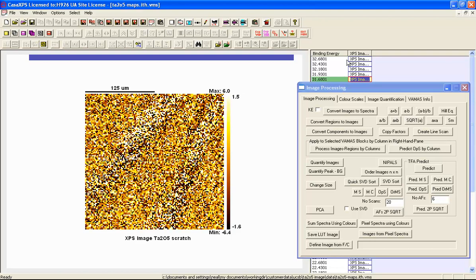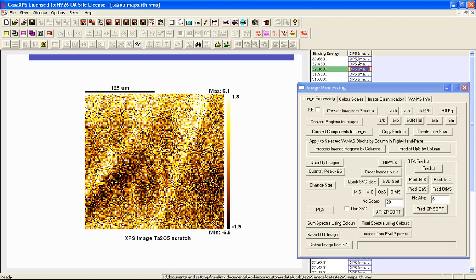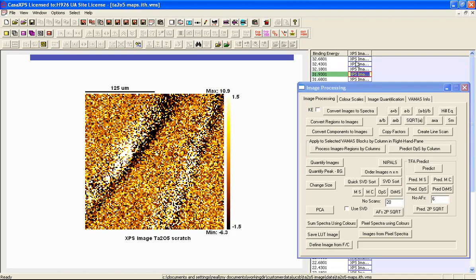So I would say for these data, at least for a first guess, I've got three, possibly four components that represent the principal components calculated from the data set. This is based on a calculation that projected 65 images into a 20-image data set, and then the PCA calculation is performed on the 20 images that result from this projection operation.